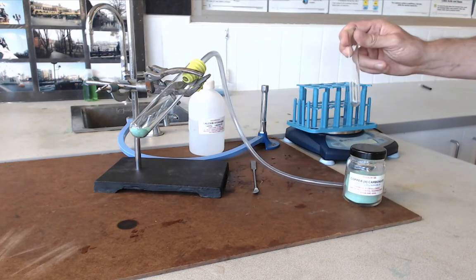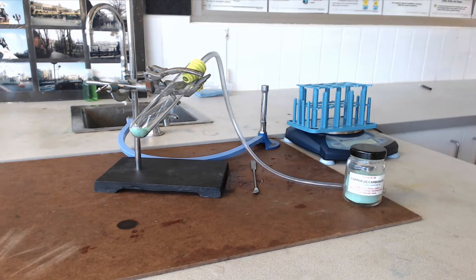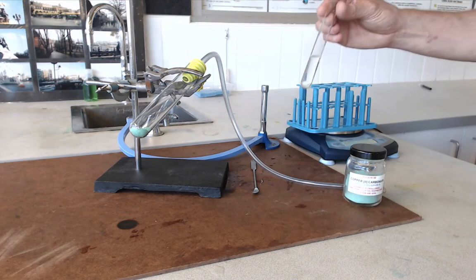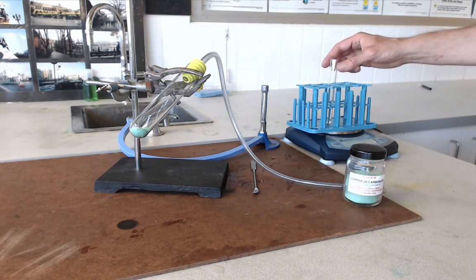The test tube needs to have some lime water in it. Take some lime water and put a little bit in your test tube — about a third full. You also need to weigh this tube, so put it in your test tube rack, see how much it weighs with the lime water, and record that mass.